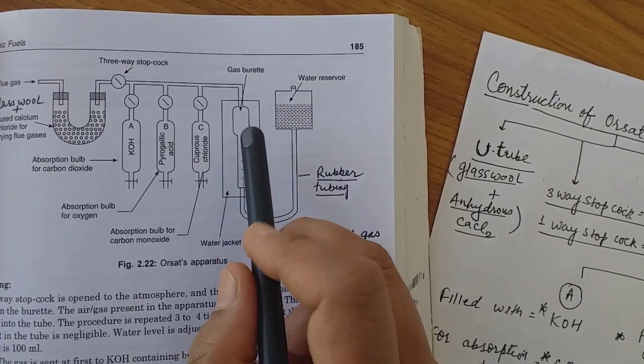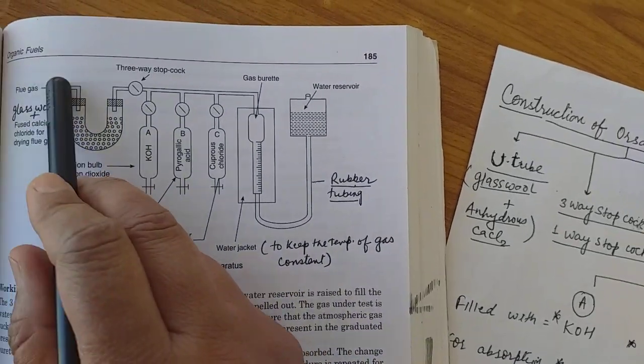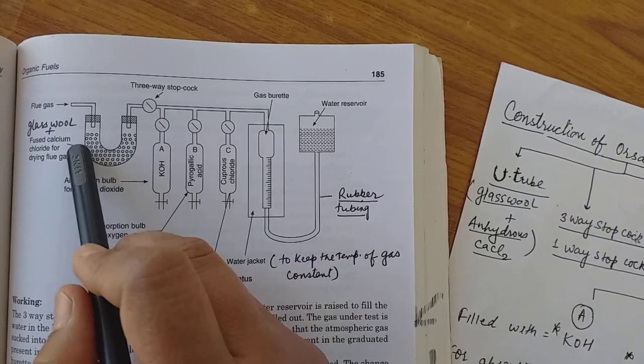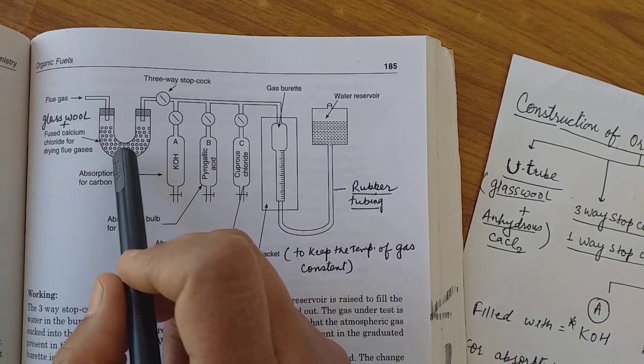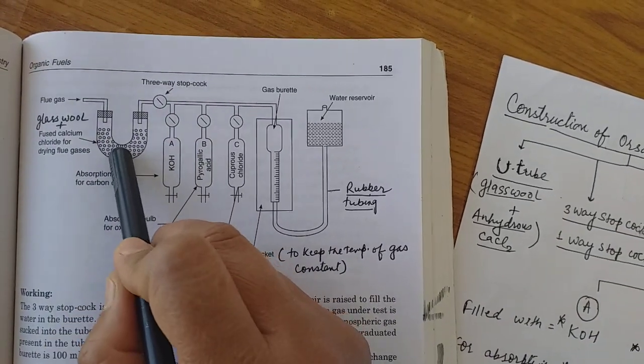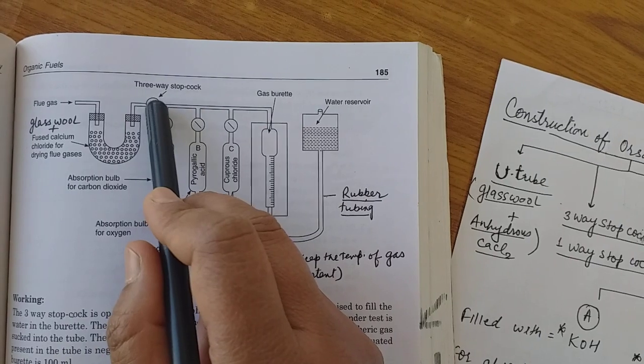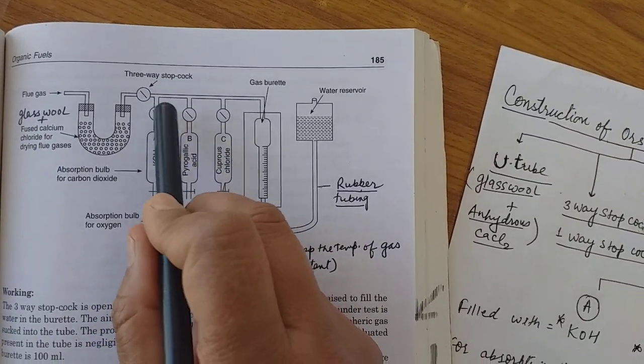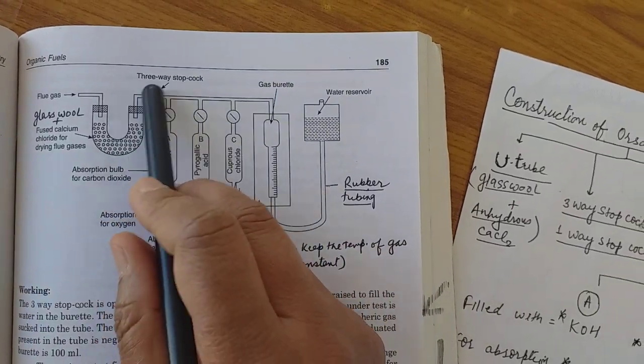After that, when this gas is coming here, first by the U-tube it removes the unburnt carbon particle, smoke particle, and moisture. After this, three-way stopcock opens to the first bulb. Here there is a one-way stopcock. Flue gas passes here.